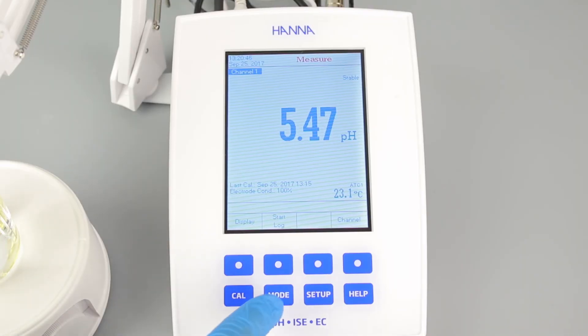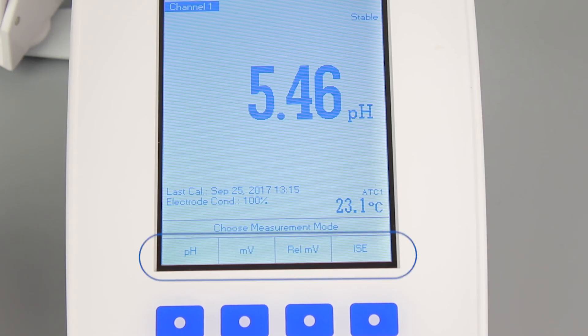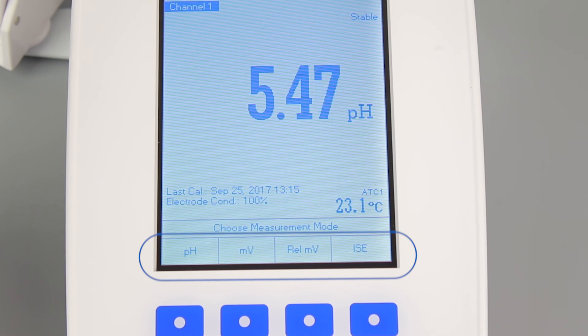After calibration, you can begin taking measurements. Place the electrodes into your sample and wait for a stable reading. Once stable, you can press MODE to switch between pH, mV, relative mV, and ISE.